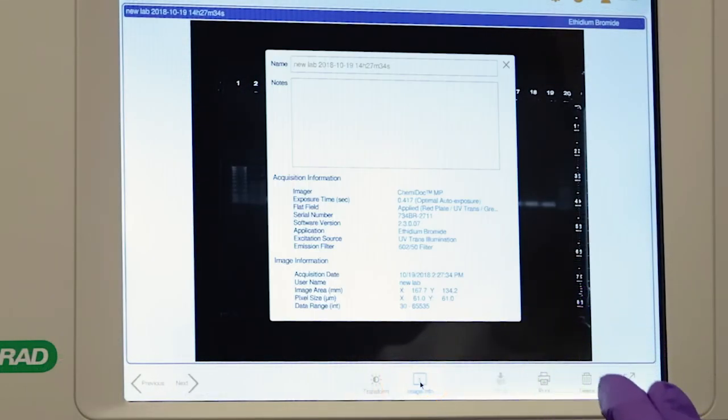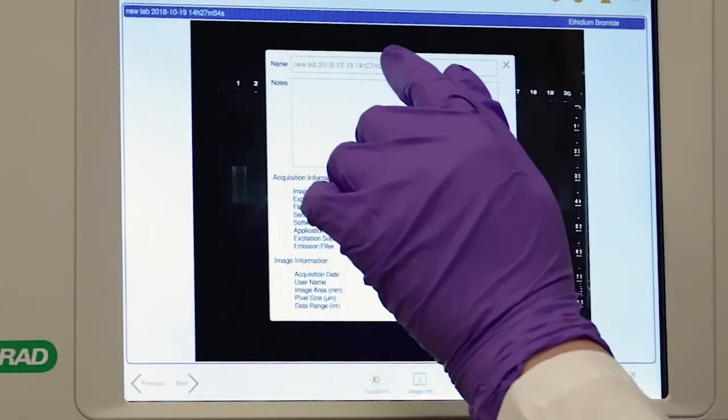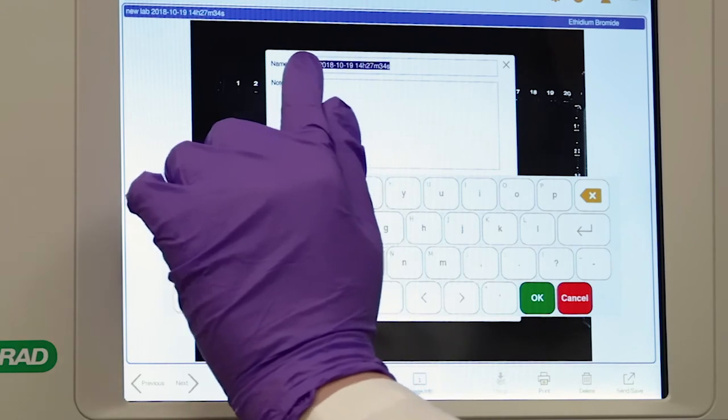Tap the Image Info icon. Here you can enter a custom name and notes about your image or experiment.